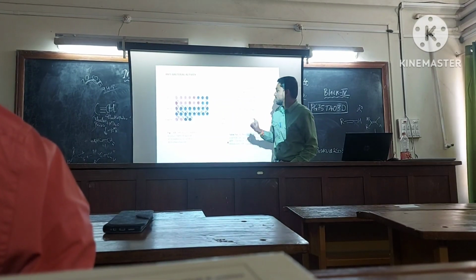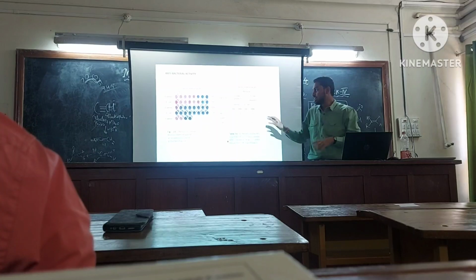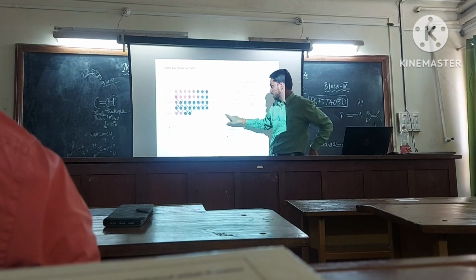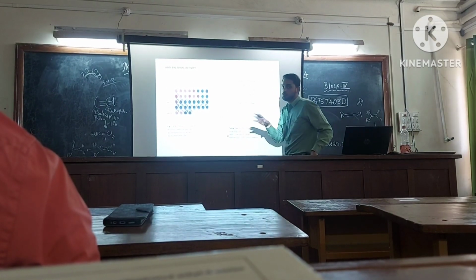MBC: if I want to kill the bacterial inoculum completely, then I need to supply 128 micrograms per ml of drug. But look at amoxicillin. I need to supply only 0.5 micrograms per ml in order to inhibit the activity.